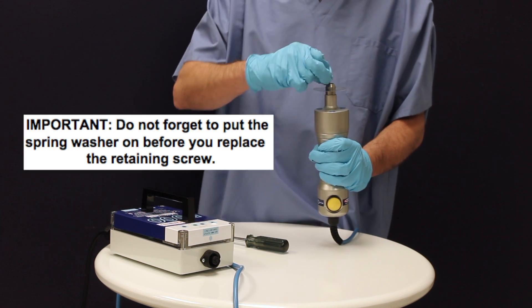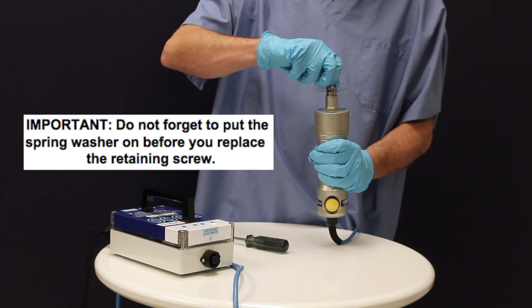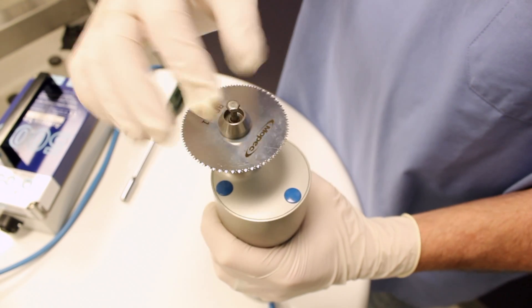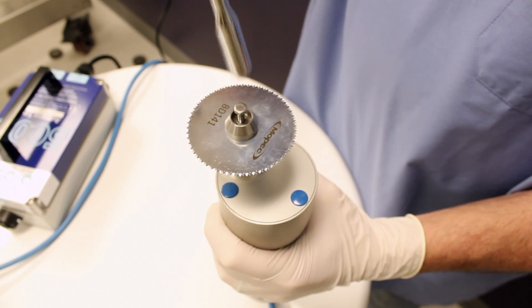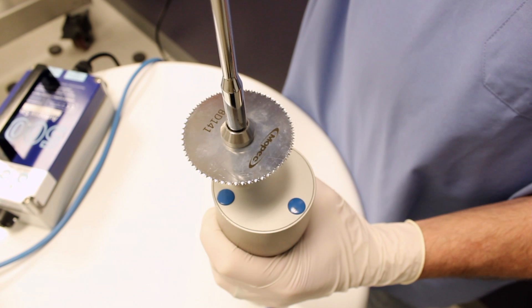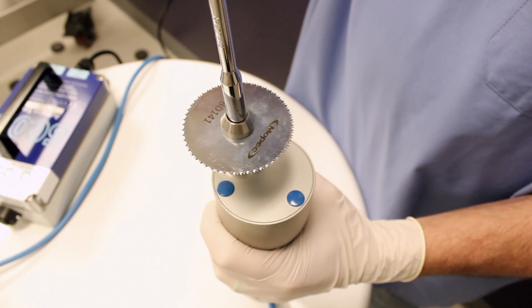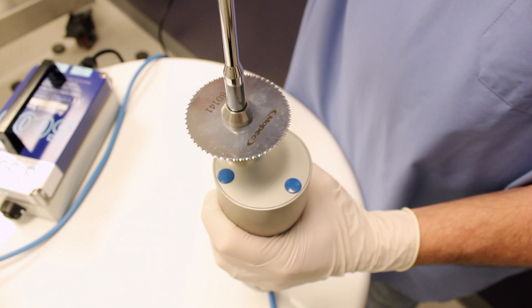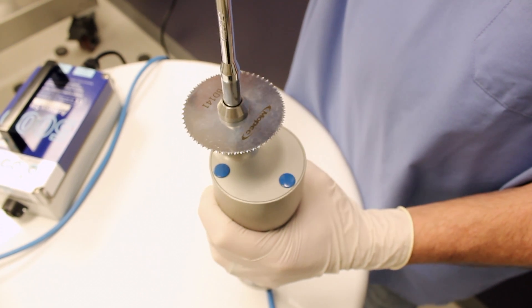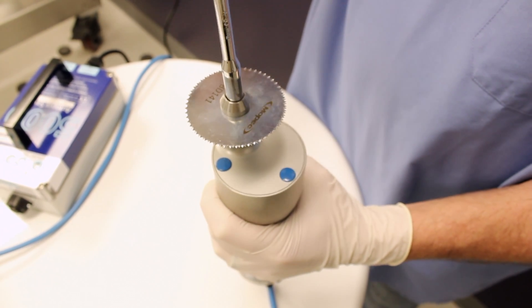Replace the clamp by starting the retaining screw into the thread. Using the same tool as before, tighten the blade down. Do not over-tighten. Once you meet resistance, give it one small turn until it stops moving.